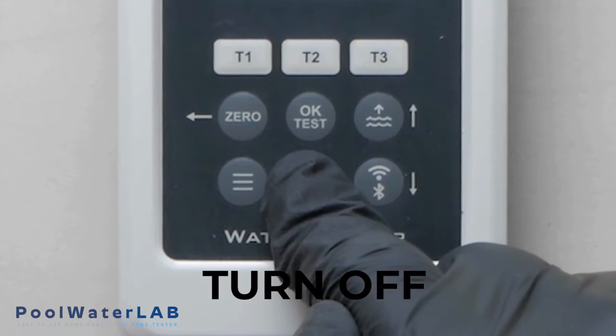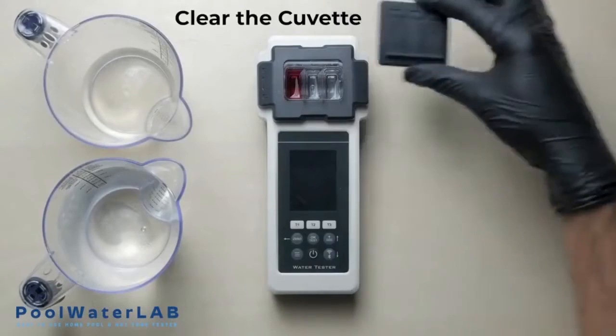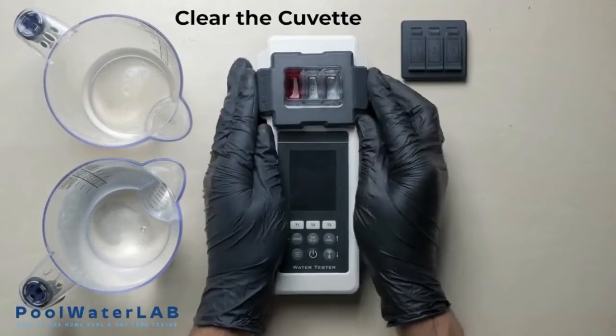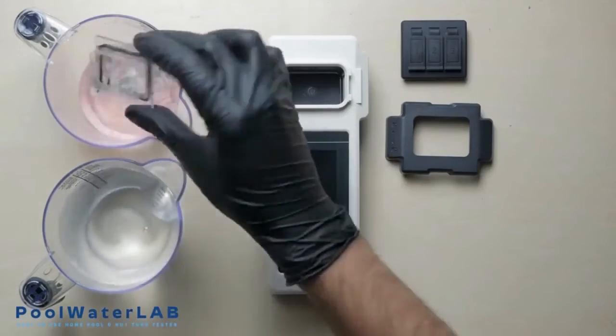To turn off the device, press and hold the off button. Run another test if necessary. After completing the test, obligatory rinse the cuvette with clean water.